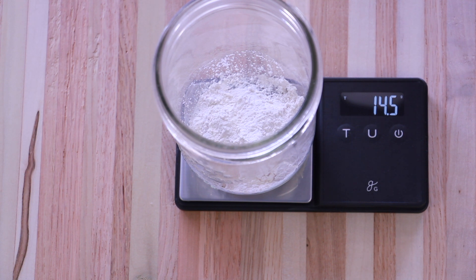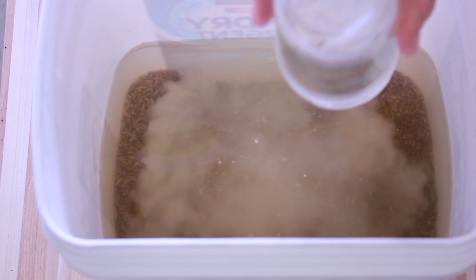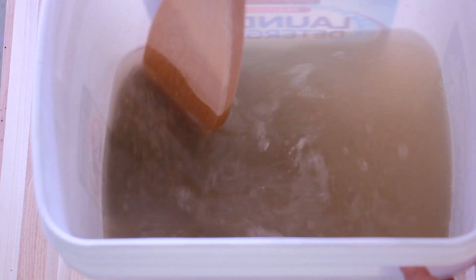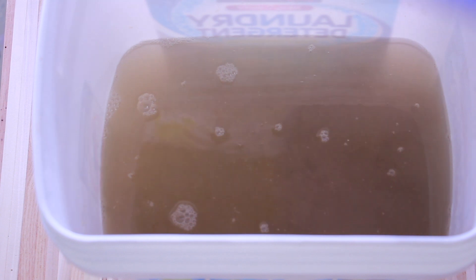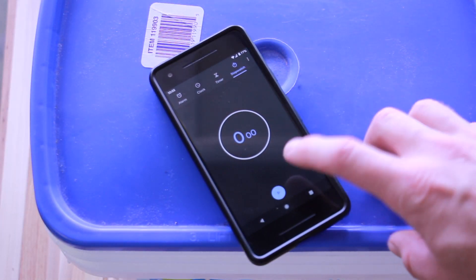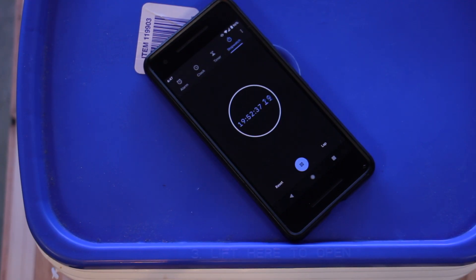I went 0.1 grams over — I'm not too concerned about that. Add the gypsum powder to your water and rye grain mix and give it a quick stir. Put a lid on your container; if you don't have a lid, just cover it with saran wrap. And then we're going to let it soak for 12 to 24 hours. I let mine go until I woke up the next morning and it ended up being almost 20 hours.